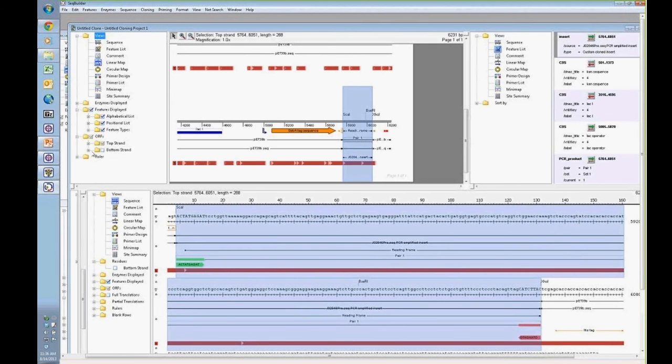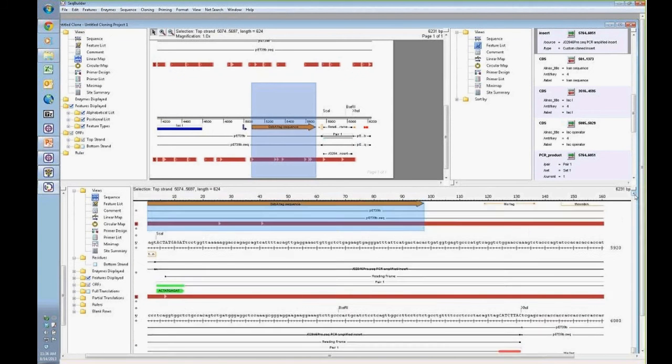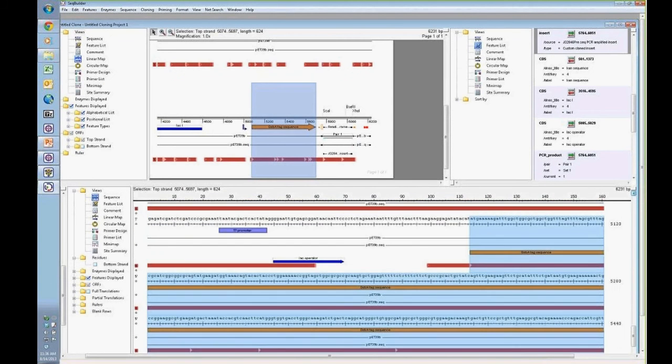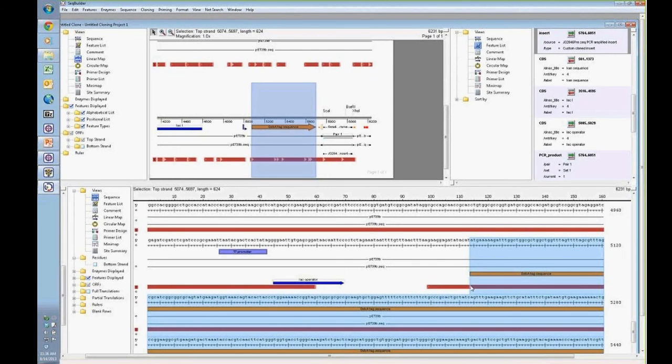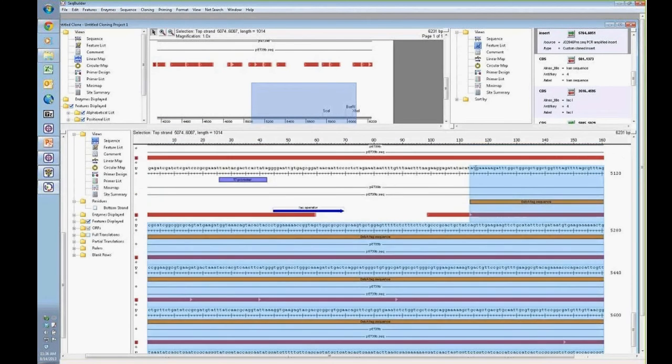I also want to take a look at the open reading frame, so I know this is frame number 1. But I also want to take a look at what's being shown. There's that tag that's been inserted at the 5' end of that target. You can start taking a look at, okay, there's my initiating methionine. There's my T7 promoter. You can take a look at the spacing between that initiating methionine and that T7 promoter just to make sure there's sufficient room, like so. If I drag this up, you can also see where the initiating methionine is starting. It's going to translate my DsbA tag.